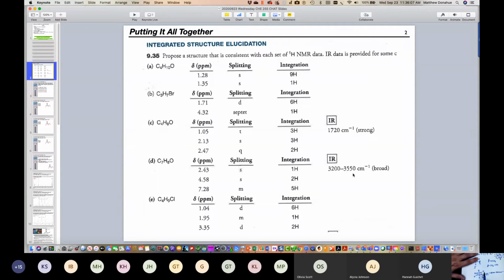In the strictest theoretical sense, these hydrogens are all not the same, but for monosubstituted benzenes, they sort of occur in one signal, because the instruments can't really resolve them.